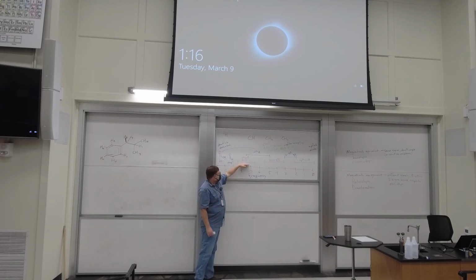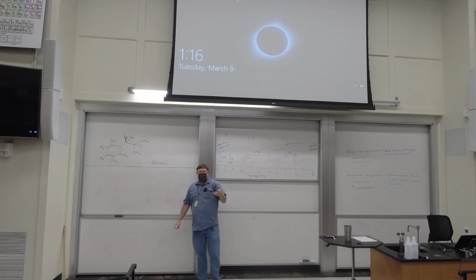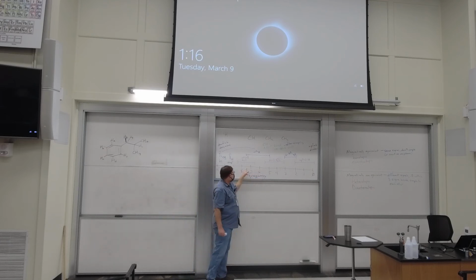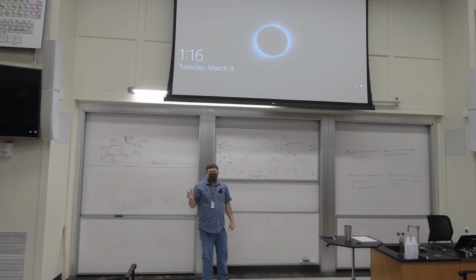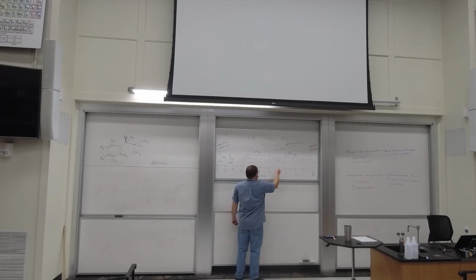But here we've got benzene, sort of 6.5 to 8.5. Protons on double bonds that aren't benzenes, so alkenes, kind of come 5 to 7.5. Protons on sp3 carbons, say this here. Protons on sp3 carbons that are bonded to something electronegative, chlorine, oxygen, nitrogen, bromine. That's going to kind of come 3 to 5.5.